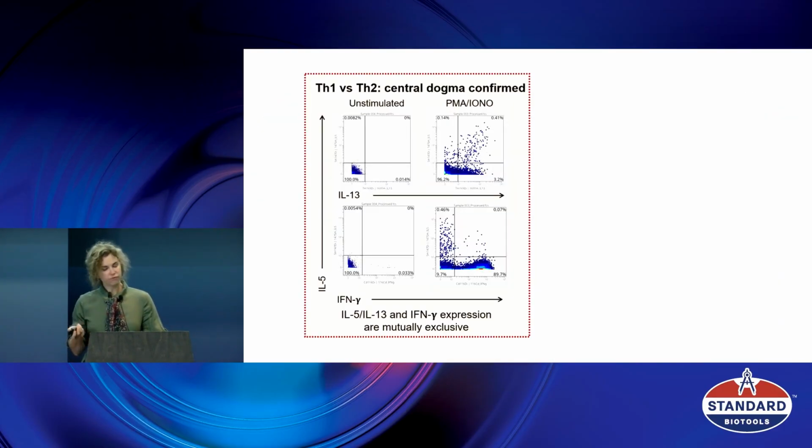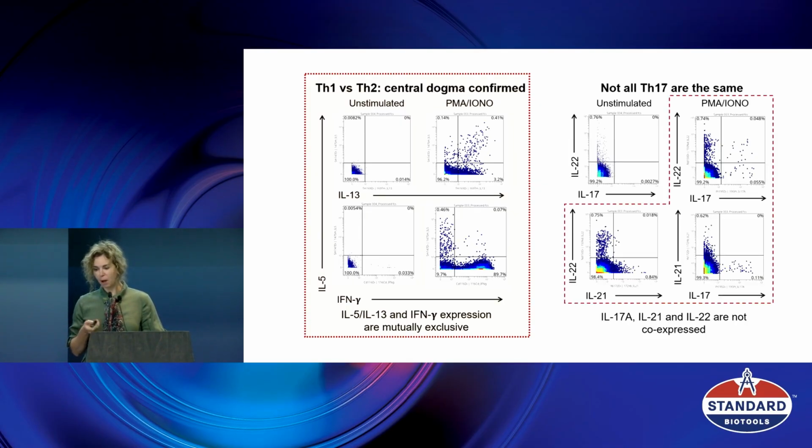So we can confirm all the usual things that you expect from that panel. We can see all the Th1, Th2 lineages. We can see the Th2 cytokines beautifully expressed. As I said, I'm always happy to see IL-5 and IL-13 co-expressed in the cell. And we have interesting complexity of Th17 cytokines presented there. So we have IL-17, IL-22, IL-21. There are patterns that are, I think, worth looking at. Again, go to the poster, squint, and look at them.